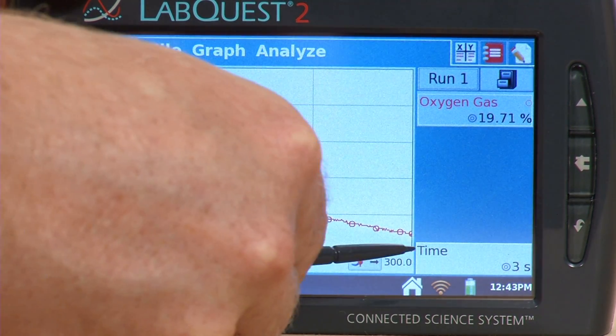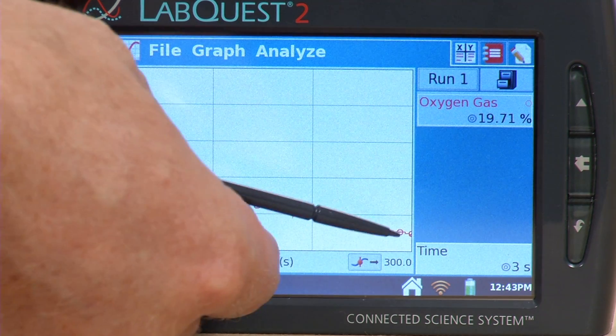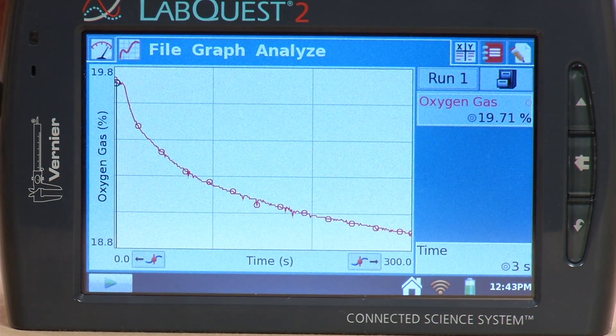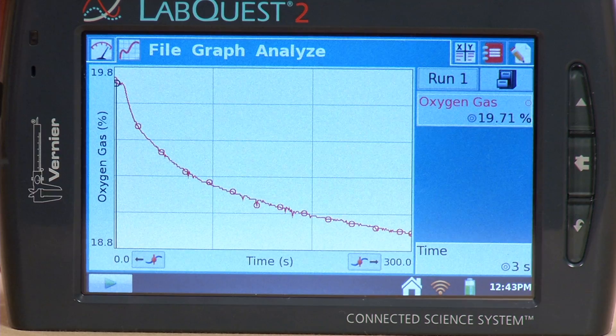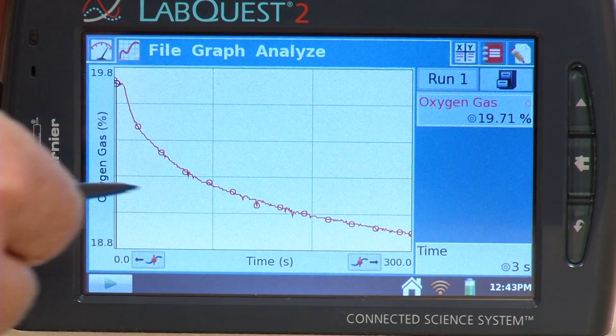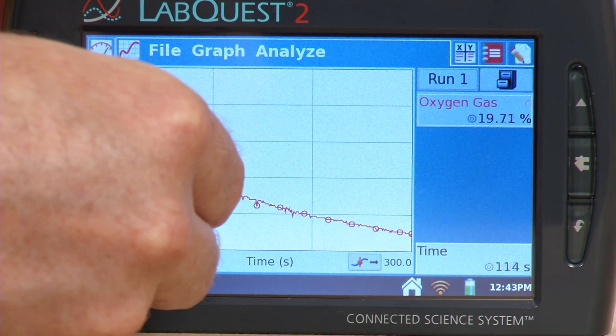But this last part there looks like it kind of levels off and becomes a fairly linear portion. And what I would like to do is analyze this section of the data. And so I'm going to highlight that.